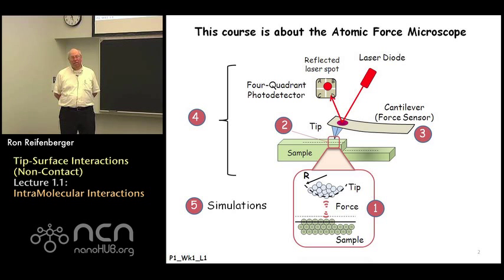In week 3, we're going to talk about how these forces are transduced and measured by a simple cantilever, which acts as a force sensor in an atomic force microscope. So in week 3, we're going to spend some time on interaction forces as measured by the cantilever. We're going to discuss the physics and the mechanics of the cantilever.